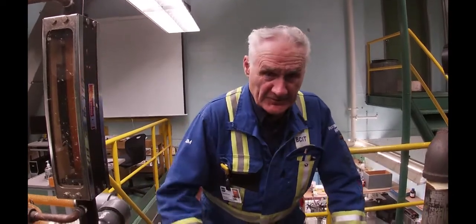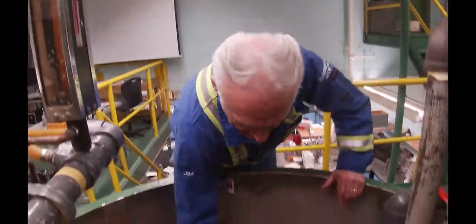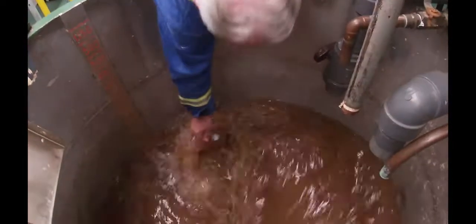And then we're going to go through this same process with the screened stock. We will see how much fiber was in there — figure out consistency — so we'll figure out how much fiber we've got. And then also we will see how many rejects are left in that, and it should be significantly less. We're going to take the sample now — I'm going to do three of these.